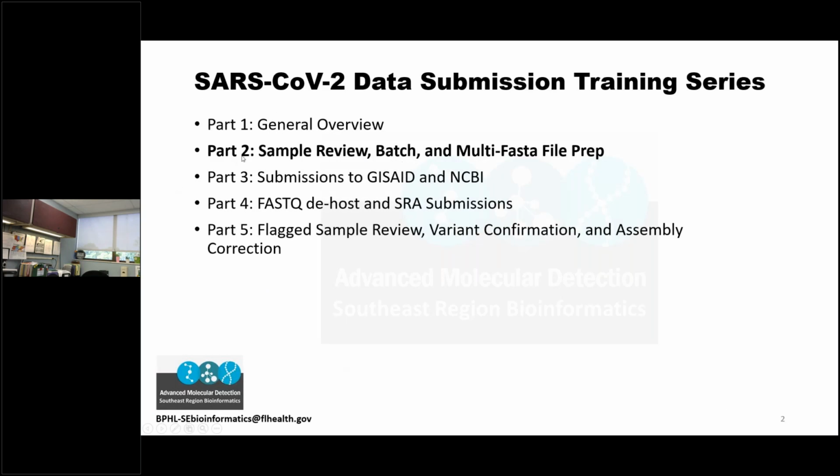Just a reminder, this is part 2 of a 5-part training series. Today we'll do sample review and FASTA prep, and tomorrow we'll go through the submission. I'll show you how to prepare the FASTAs today, and tomorrow how to use those with the web portals to submit to GISAID and NCBI. By the end of this week, you'll be able to submit the consensus assemblies and sample metadata to GISAID and to NCBI BioSample and NCBI GenBank.